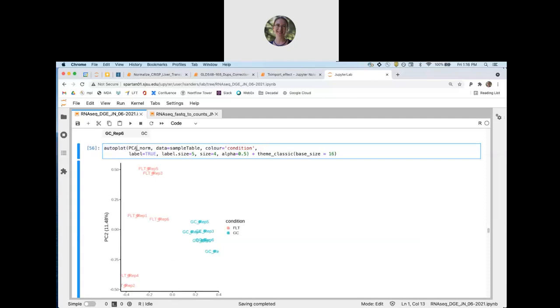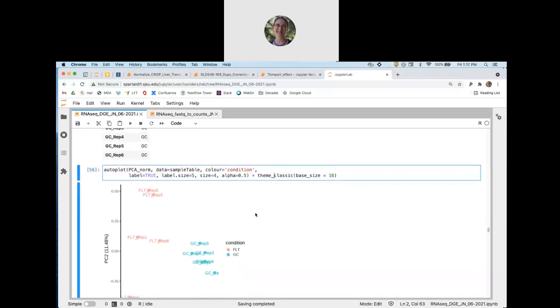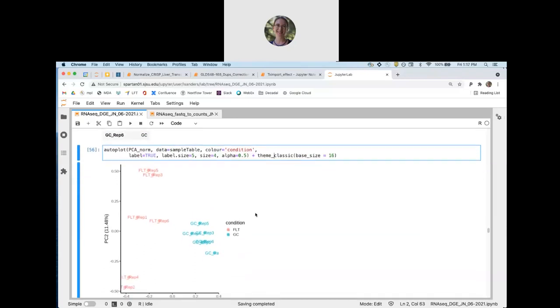If you want to change the colors in the plot, we have to go in and either change another argument for autoplot, or more likely add another layer on top of this plot to change the colors. That's a little bit out of the scope of what we're doing right now, unfortunately. Doing visualizations using ggplot in R is like its own class.